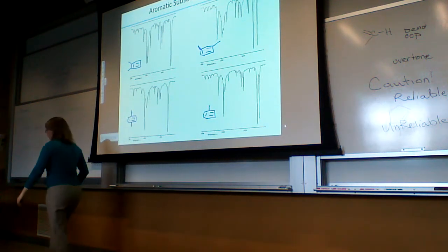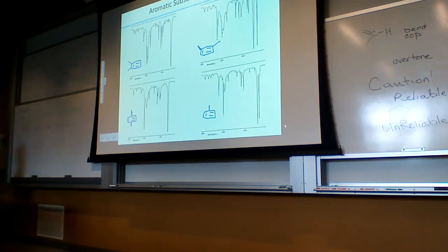And then if we look at the specific ones within the 600 to 1000 region, we see either one or two in these regions, and sometimes they have three. Actually, one of these is more than that. Yeah, that little tiny guy counts for something.